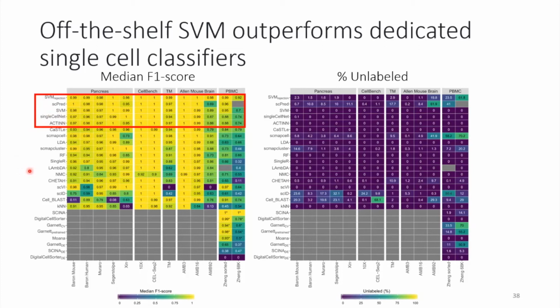I was just wondering, how in the end then do you make up your mind about which classifier to pick? We'll get to that. Remember, this is a very biased experiment that I'm showing you. So far, don't make choices just yet. This is a very biased experiment. Here we train and classify on the same data set. You will never do this, right? This is never your goal. So just wait a little bit.